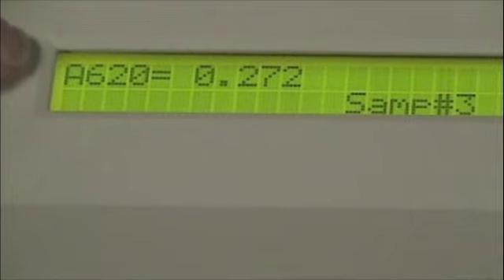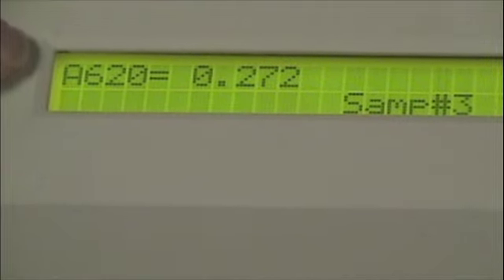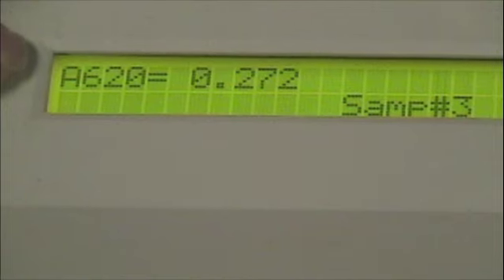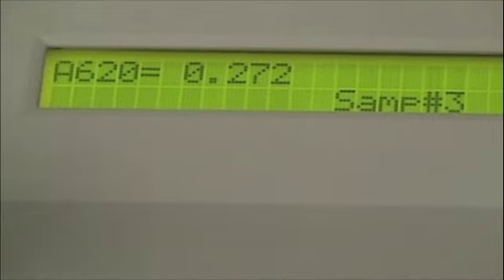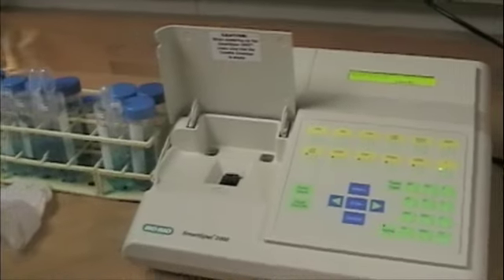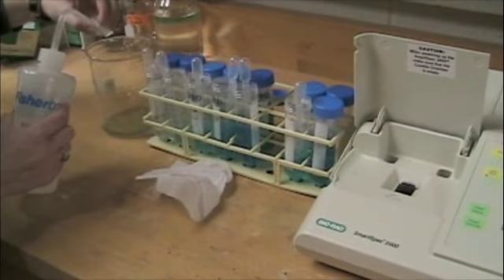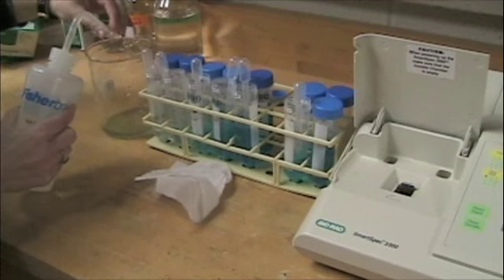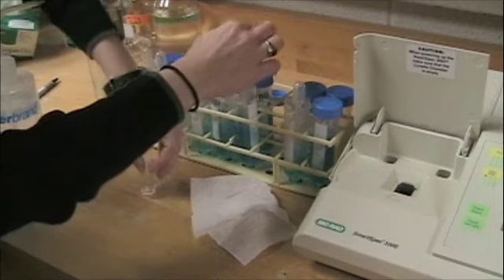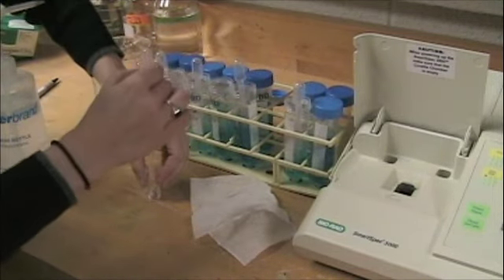Here is the absorbance for sample number 3. After you record that, take the sample out, dump it in the waste beaker, clean out the cuvette. Now we are moving on to sample number 4.